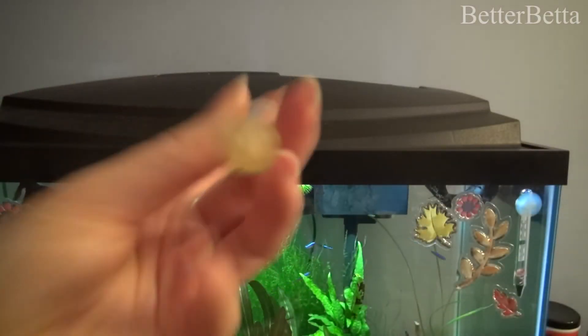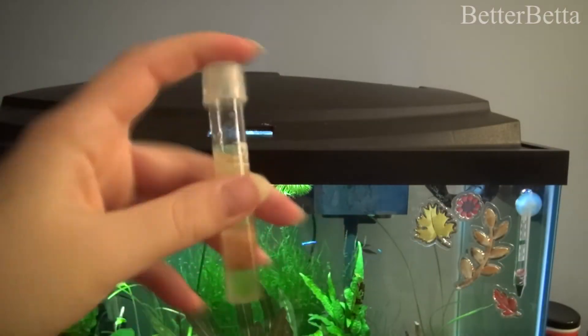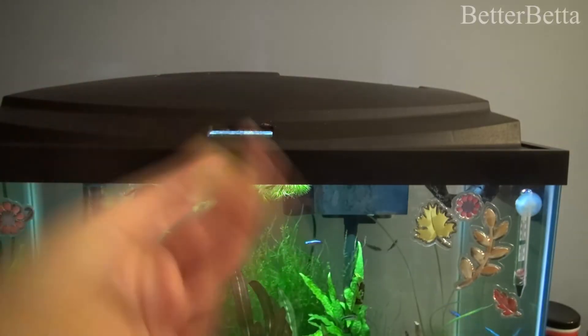If you don't shake it up enough, you might not get the correct results. Once your solution has been mixed, just put it off to the side and you're going to want to leave it for about five minutes. The color will start to develop if it hasn't already.